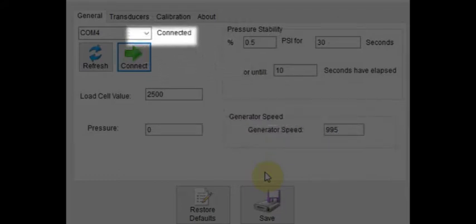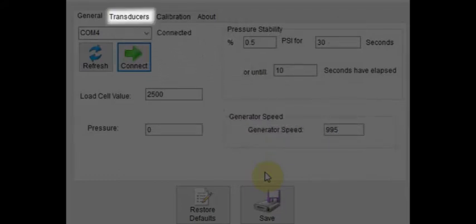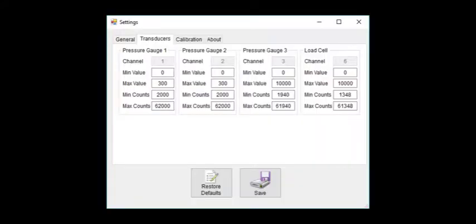Next, we can navigate to the transducers tab. Here we can view and set configurations for our pressure gauges and load cell such as the channel it is on, min value, max value, min counts, and maximum counts.